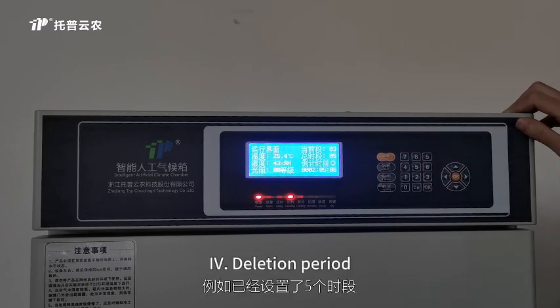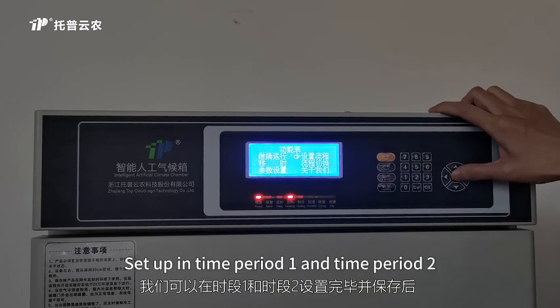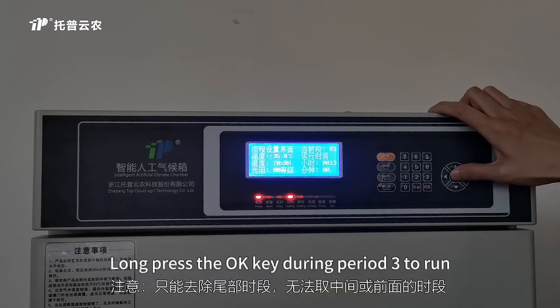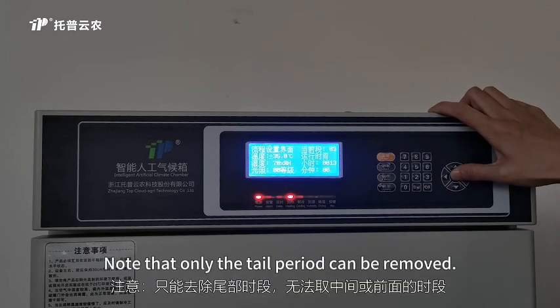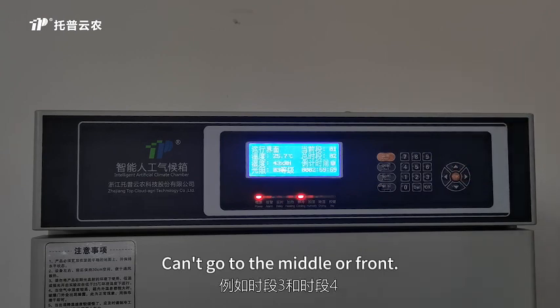4. Deletion period. For example, delete 2 out of 5 time slots. Set up time period 1 and time period 2, and save. Long press the OK key during period 3 to run. Note that only the tail period can be removed. You can't delete from the middle or front.